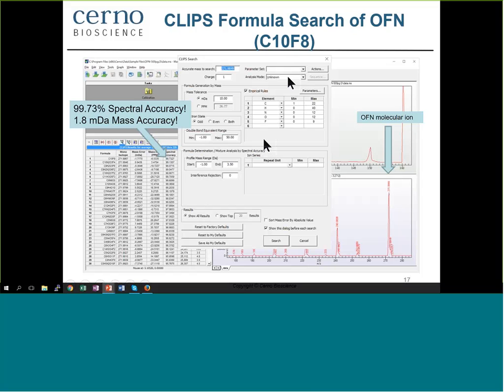What we have in this window here is our search window. Here we can specify the elemental composition, on which we can set constraints, to perform a molecular ion search. And we also set the range over which to search. So we're just going to search the profile and the mass positions of this molecular ion with the software. And of course, all the software is doing is generating theoretical mass spectra to search against. Because it knows what line shape was used in the calibration, it can generate theoretical spectra to match using that exact same line shape to get a very good match.